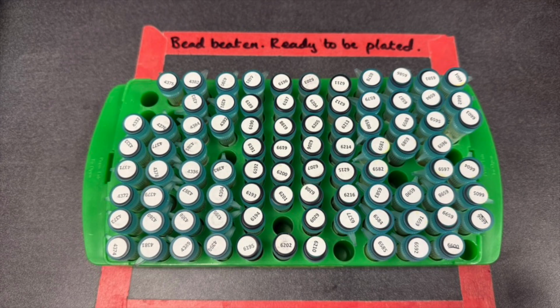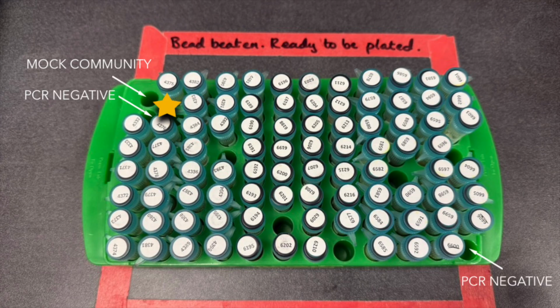I also leave a number of gaps on my plate, so I don't fill all 96 positions. The first gap I leave is for a mock community. This is a positive control of known fish DNA that I use to always make sure my PCR and my bioinformatics are working properly. I then leave gaps for 2 PCR negatives and 6 further extraction negatives, and having these will allow me to differentiate from any contamination that might happen on the plate during the extraction or during the PCR setup.